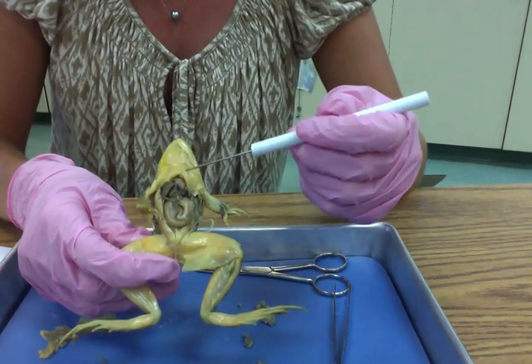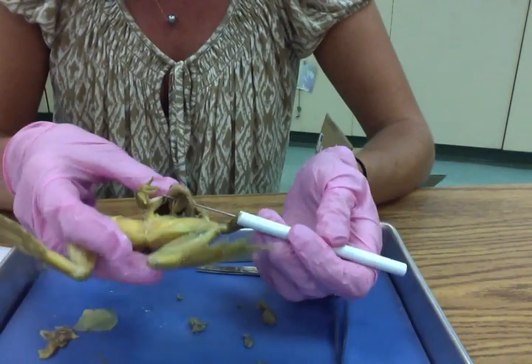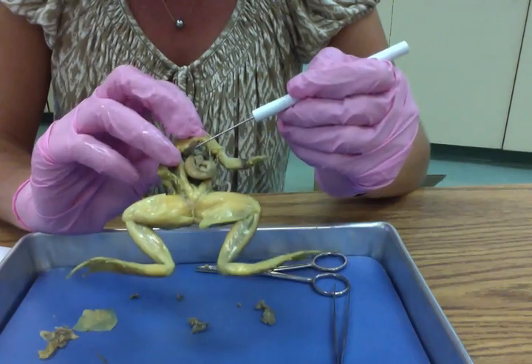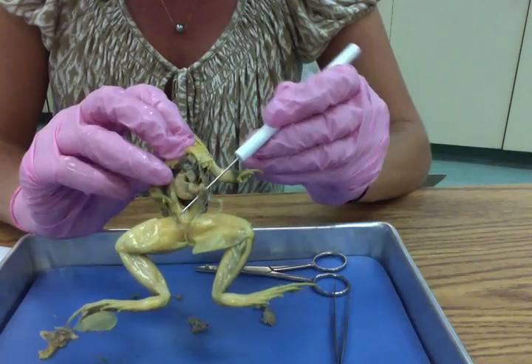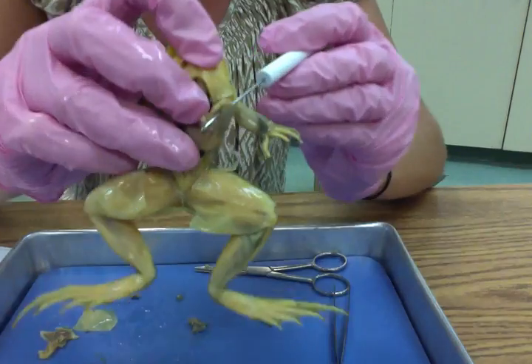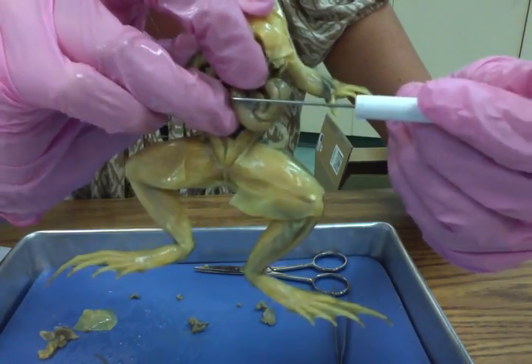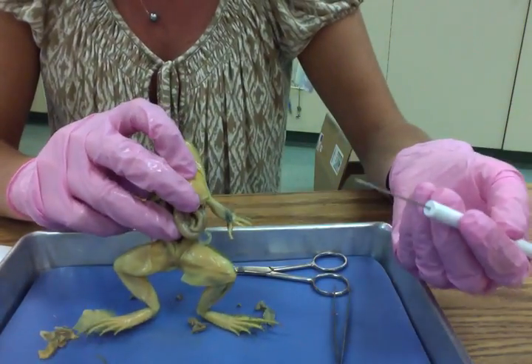If we move posteriorly towards the bottom, we'll see this kind of pinkish, whitish sac right here. It's pretty obvious. That's the stomach, right? The stomach stores food. If we follow the stomach down, we'll see the small intestine. You're going to want to trace the stomach down to the small intestine and then continue to trace it to the large intestine. That's the digestive tract for the frog, right? It goes from the stomach to the small intestine to the large intestine and out as waste.